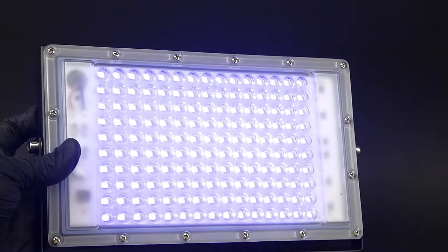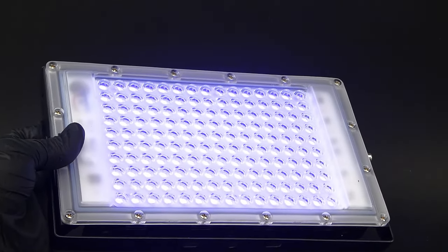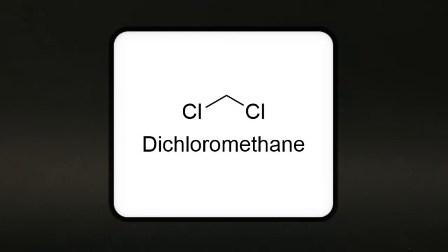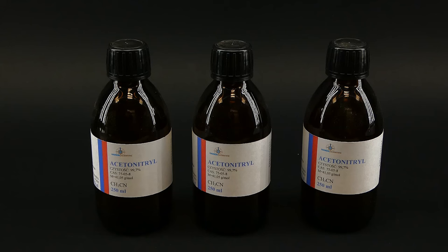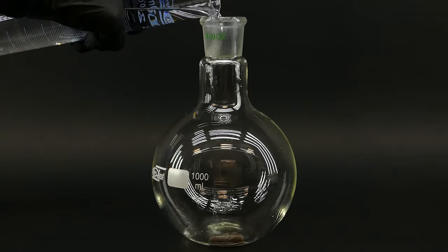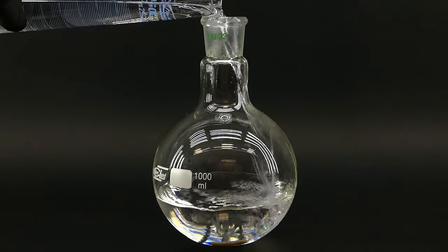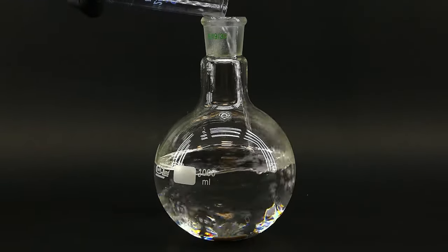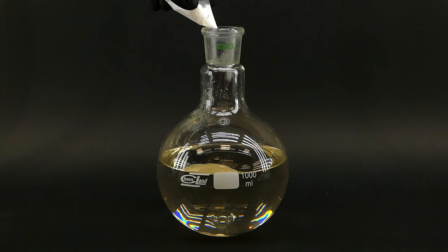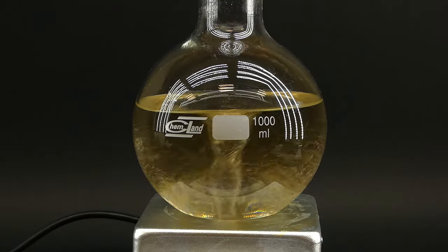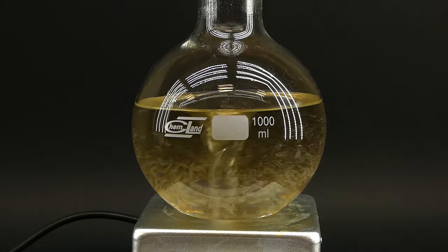Thanks to that, I was able to buy a chunky 100-watt array of 395 nm UV diodes, which would be perfect for this. To start setting up, I first had to take care of the solvent. I could use dichloromethane, but it has a very low boiling point and since everything will get quite hot, I had to use acetonitrile, which is highly expensive. I measured out 650 ml of it into a 1-liter flask with a stir bar, then added in all of the diketone followed by 5.96 grams of benzophenone, and stirred everything to dissolve the solids, leaving me with a slightly yellow solution.